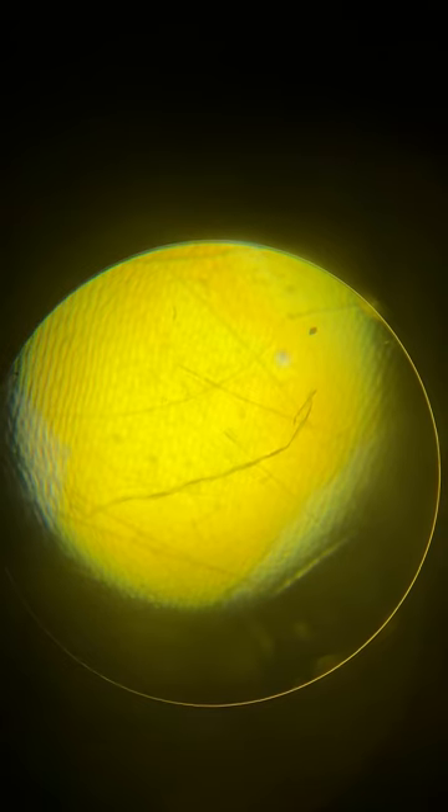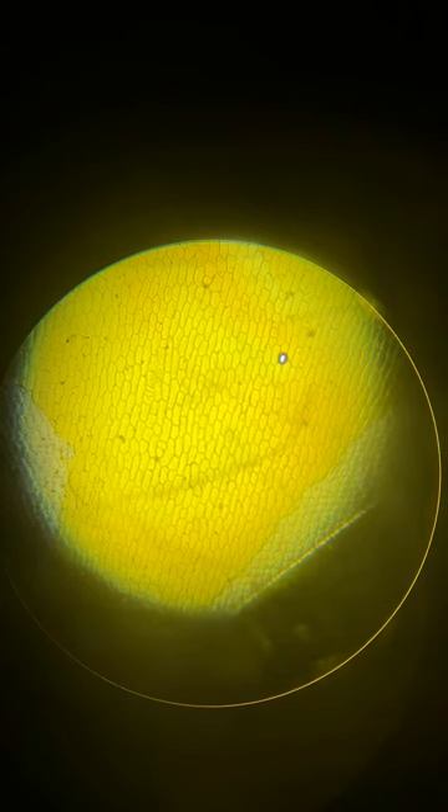See if you can find what we like to call crooked bricks. Look at this over here — I'm going to go ahead and readjust. So that right there is what I'm trying to find. These are hundreds of cells of epidermal skin of the onion.